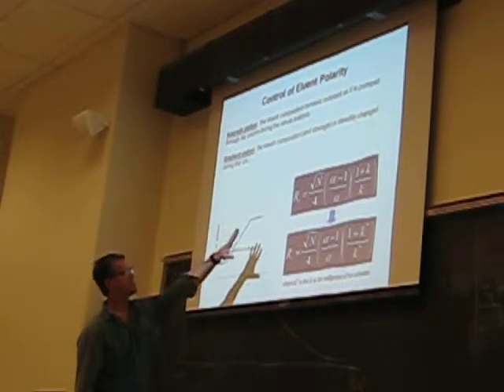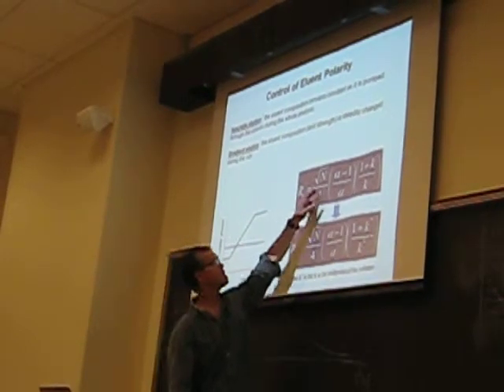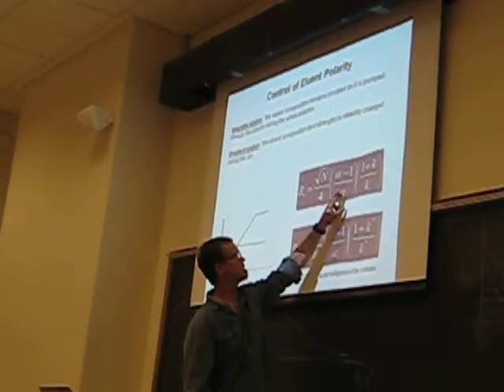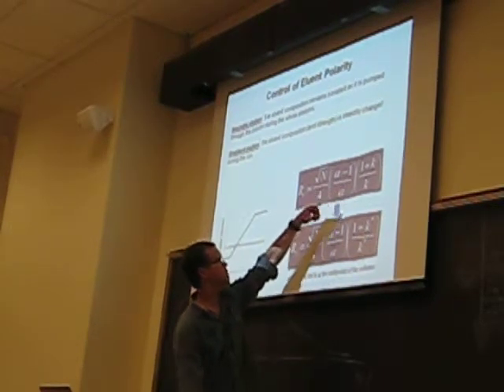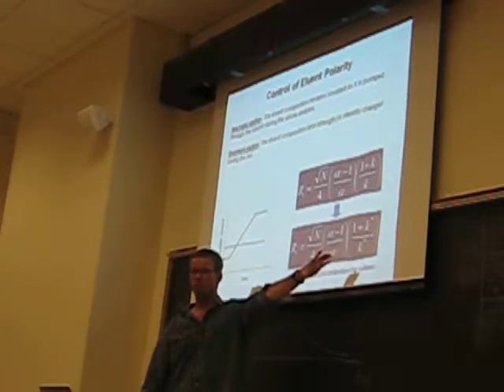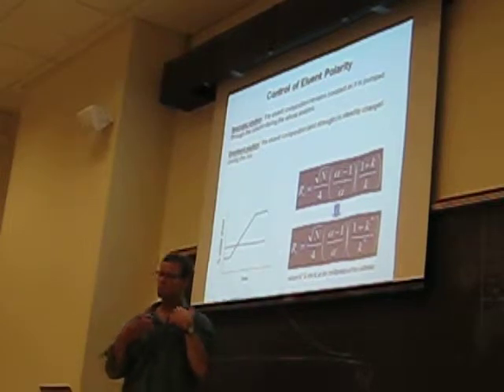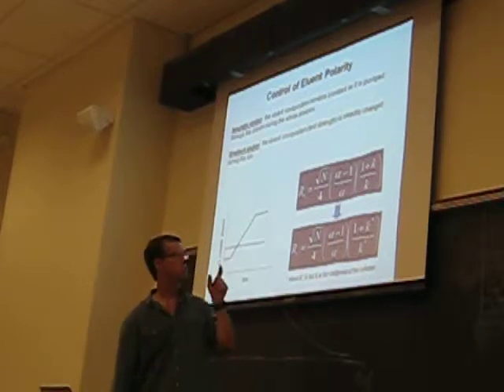And in both cases, you can actually determine the resolution of samples by knowing some of the things we just talked about: by knowing the theoretical plate height, or the number of theoretical plates, which is going to be determined by the plate height, by knowing the selectivity factor, by knowing the retention capacity factor. You can use those parameters that are all determined by the chromatogram, and knowing your plate height and your column length, to actually calculate resolution and maximize resolution. And so, rather than use an empirical approach just based on how the peaks look, one could actually calculate under certain conditions what the resolution is.